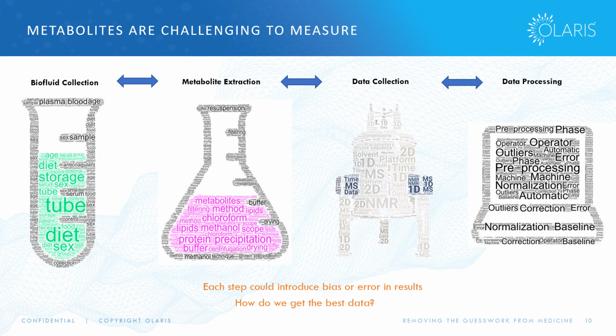And then we go to metabolite extraction. Are you using any extraction method? Do you use protein precipitation? Do you need to extract the lipid layer? What are the solvents that you use? What are the buffers that you use? We get then to data collection.